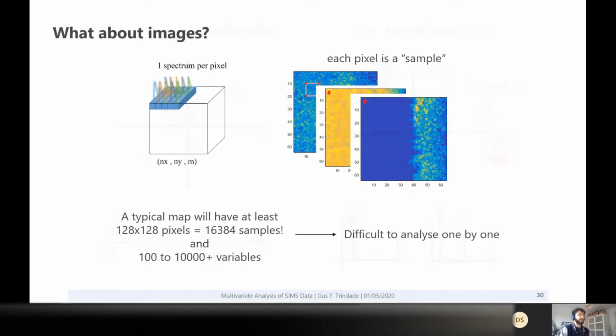So moving forward, we can think about applying this to images, because as I said, images is where you have loads of pixels and variables and observations. So we just use the exact same concept, but now we use each pixel as a sample. So we can do all those same scatter plots. But actually we have the advantage of knowing the relationship between these observations, like the spatial relationship.